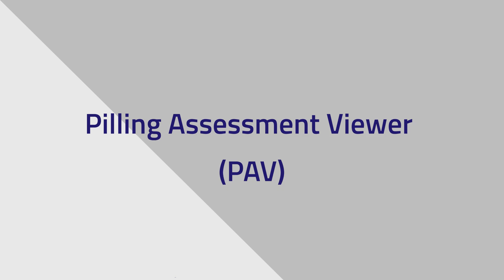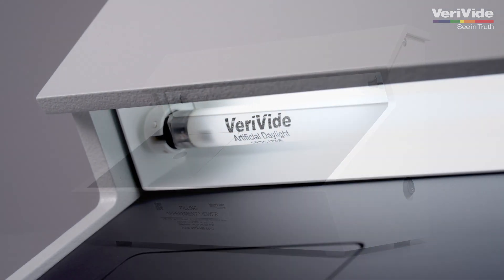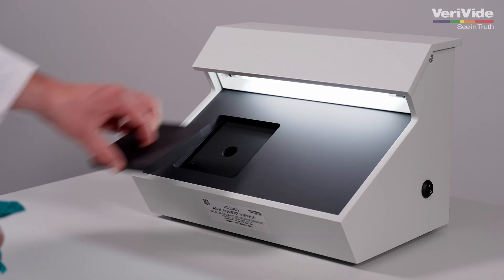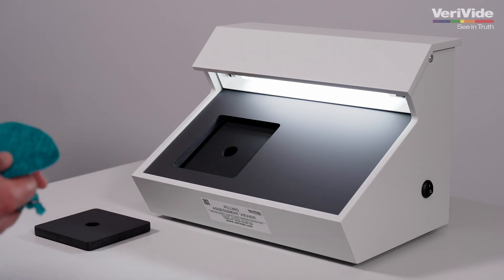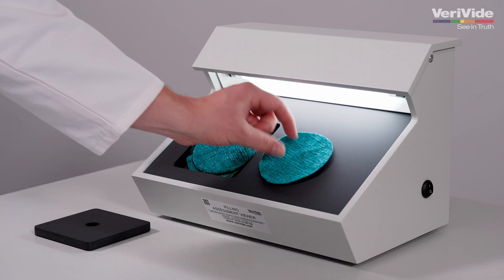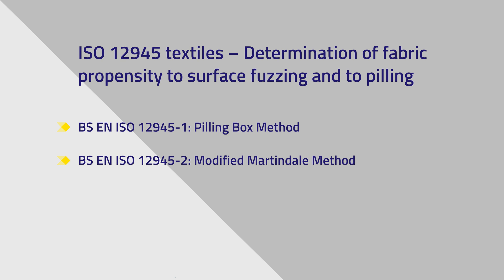The Pilling Assessment Viewer was originally developed by Verivide with the help of a major textile testing company to meet the requirements of ISO 12945 textiles — determination of fabric propensity to surface fuzzing and to pilling. This industry standard is specified by major retailers and incorporates the following three methods: Pilling Box Method, Modified Martindale Method, and Random Tumble Pilling Method.